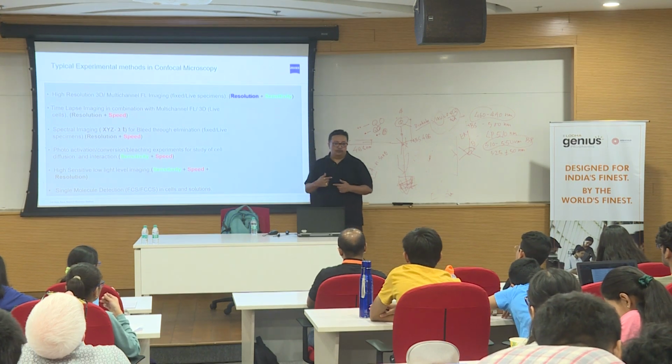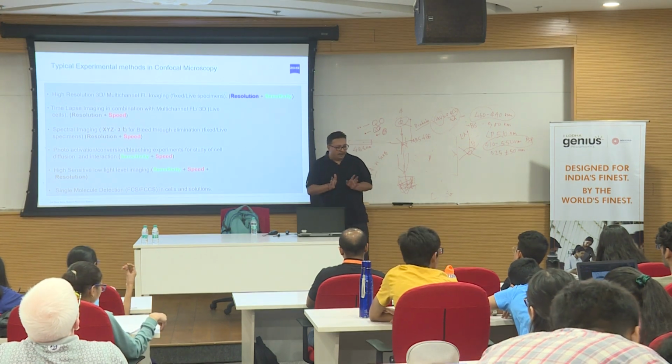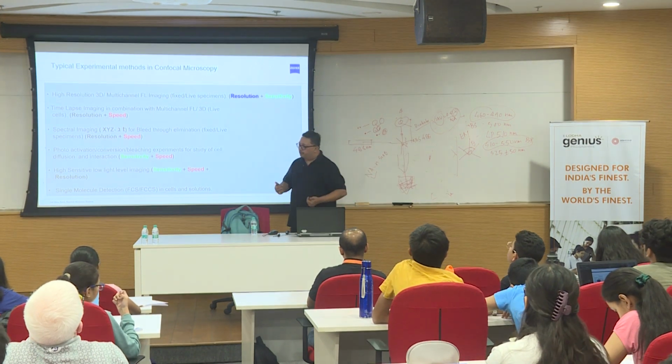And that is what quantification means in terms of image quantification. And this cannot be done with a regular fluorescence microscope because of the haze information, because of the blur information. That can only happen with respect to the confocal microscope.